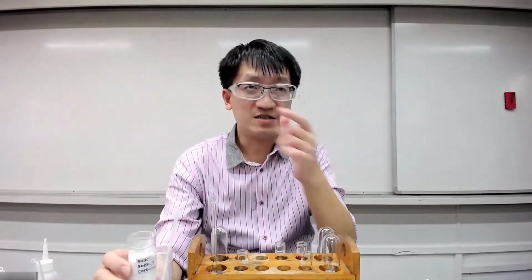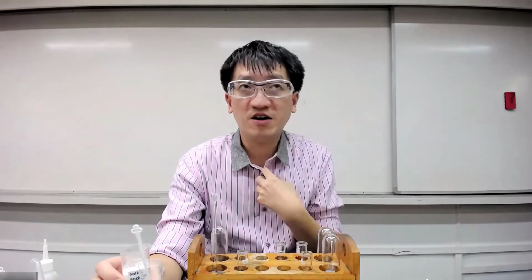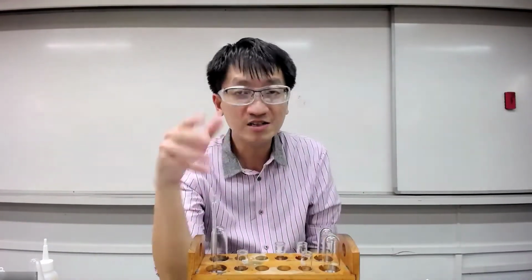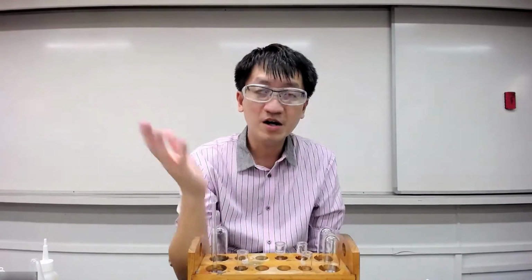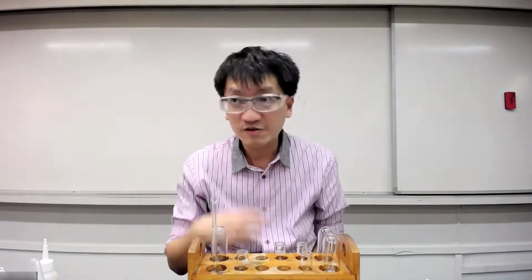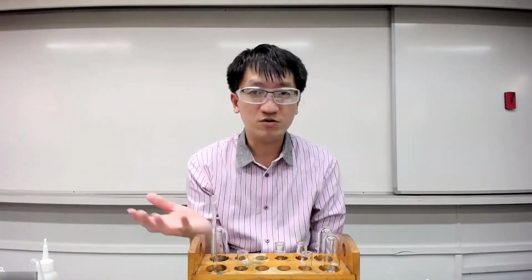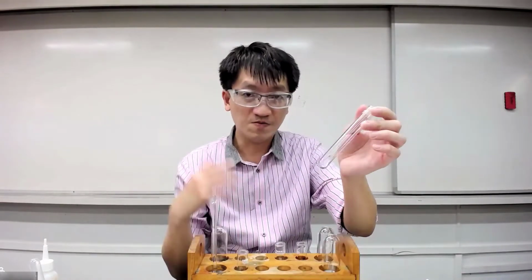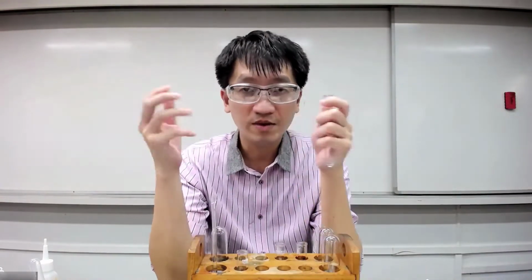But before we add in, we need to ask ourselves the purpose of adding sodium carbonate is probably to precipitate out insoluble carbonates. And at the same time, if the solution is acidic, you are expecting CO2 to be evolved. So if CO2 is evolved, then what do we need to do next? We need to test it with lime water.